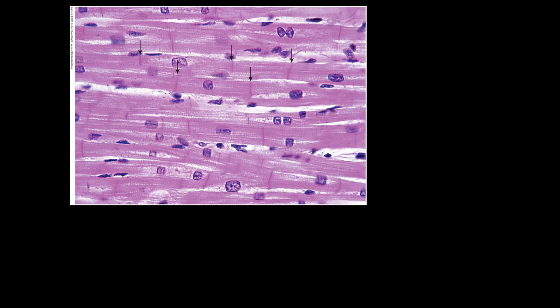Here is just a profile of the myocardium, cardiac muscle. You can clearly see the nice intercalated discs. Note the central location of the nuclei in the cardiac muscle cells and this perinuclear area that's going to be rich in organelles and glycogen.